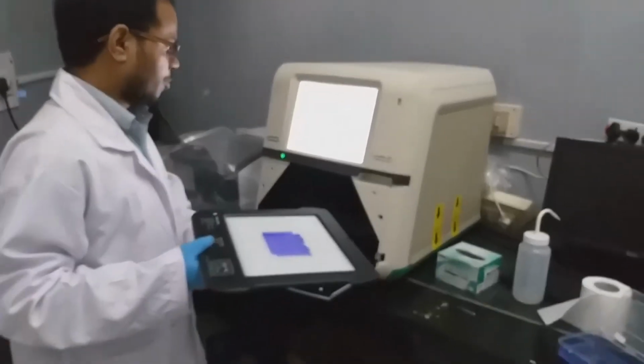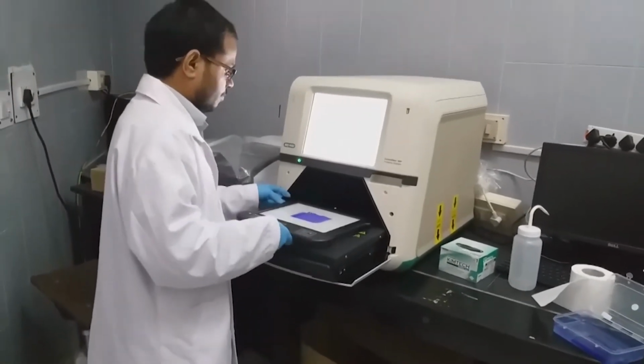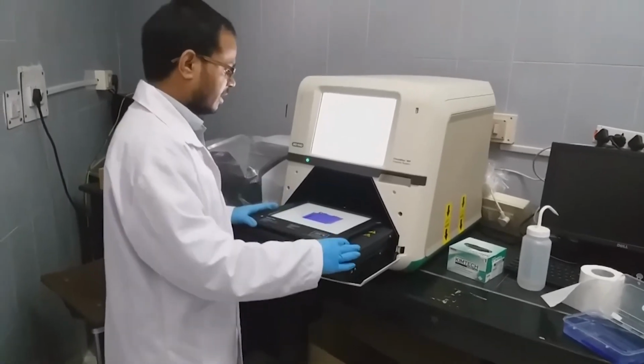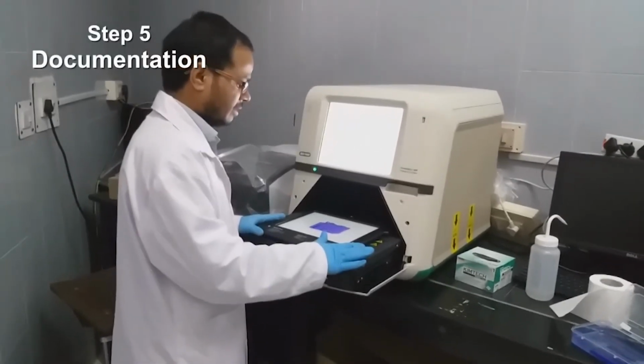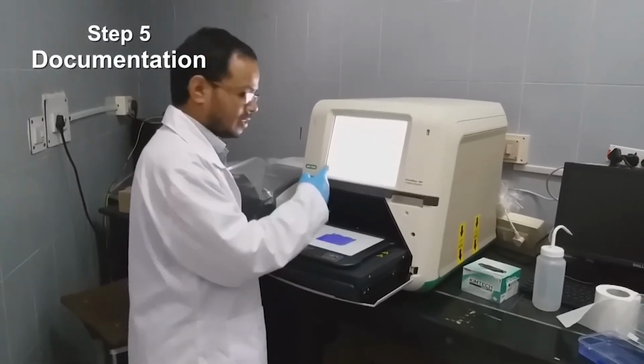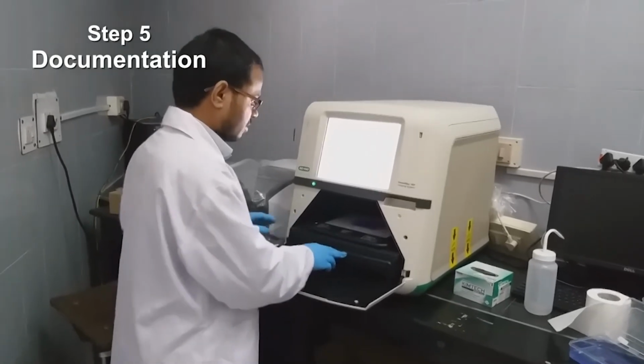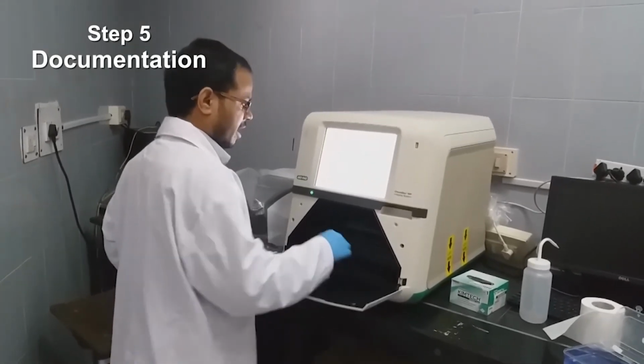So we have to open it properly. This is a very important step. You have to align the tray in a proper way, otherwise it will show an error. Once it is over, you just push it back.